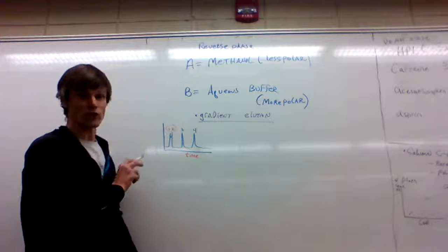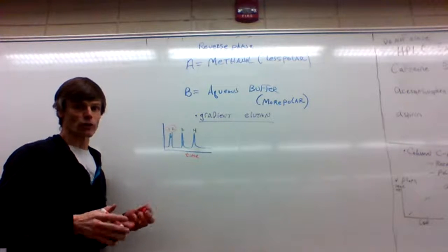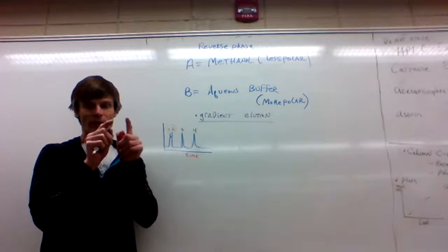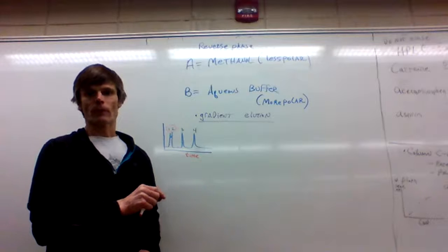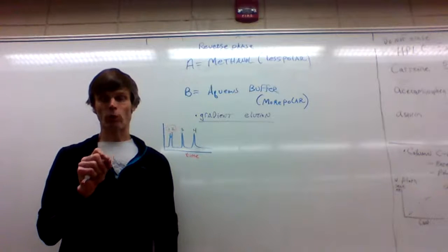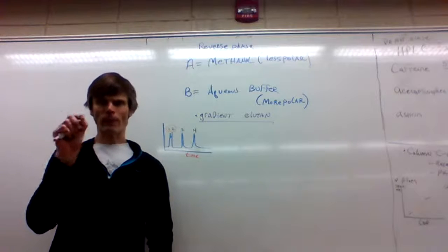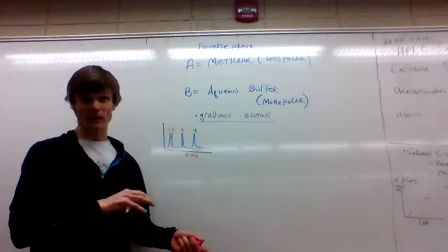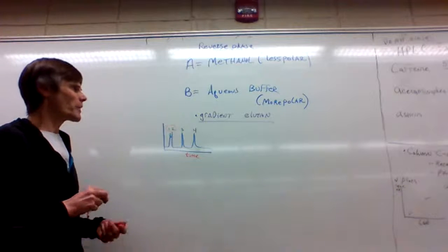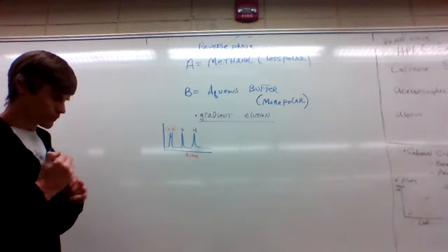There's 2 things we should recognize. First of all, we're not getting good resolution. They're almost sticking together. And we can tell you another thing. They're both going to be fairly polar. Number 1 is the most polar. Number 2 is probably a little less polar than number 1. Got it? Makes sense? Well, how can we encourage this separation?